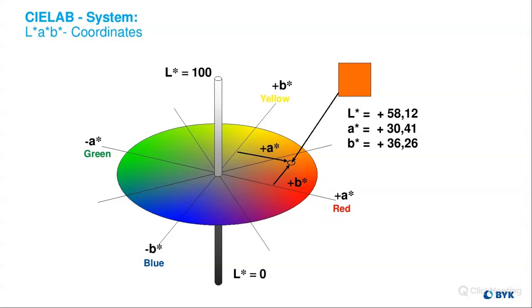So it doesn't really matter. Really, the light source, especially these days, is with an equation. So we found that D65 has a certain wavelength, and we can input all that data into the different equations, and it doesn't make a really big difference.